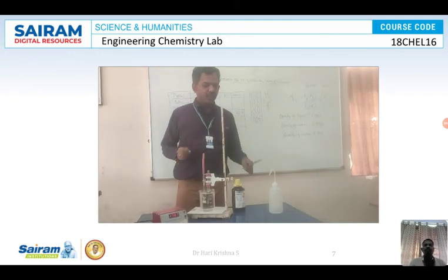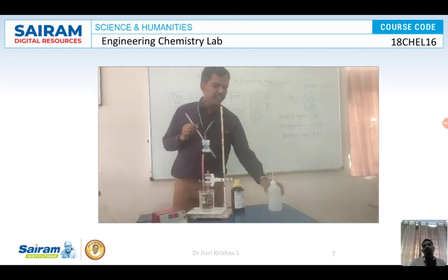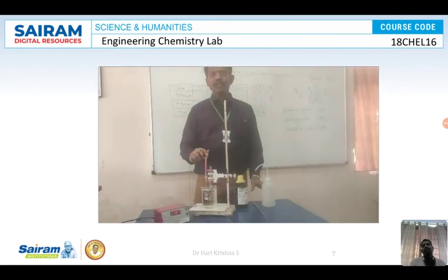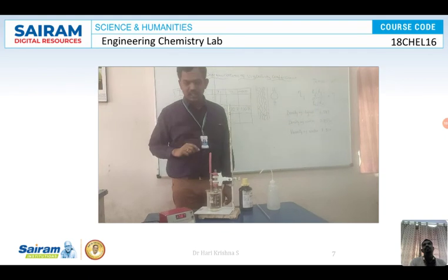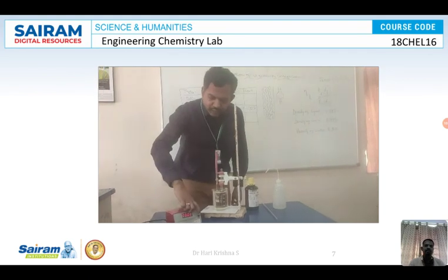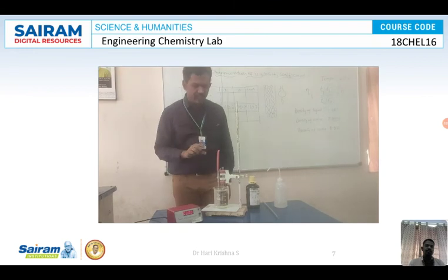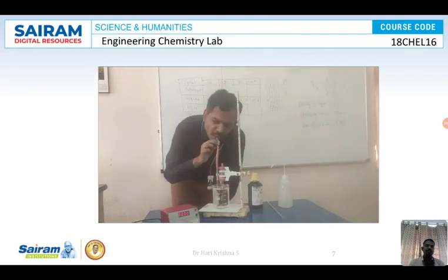with water. So take 10 ml of deionized water, distilled water, and fill it in the viscometer and repeat as you have done earlier. When you set it to 0, you can add 10 ml of water into this and repeat as you have done earlier. Going to pull this once again.